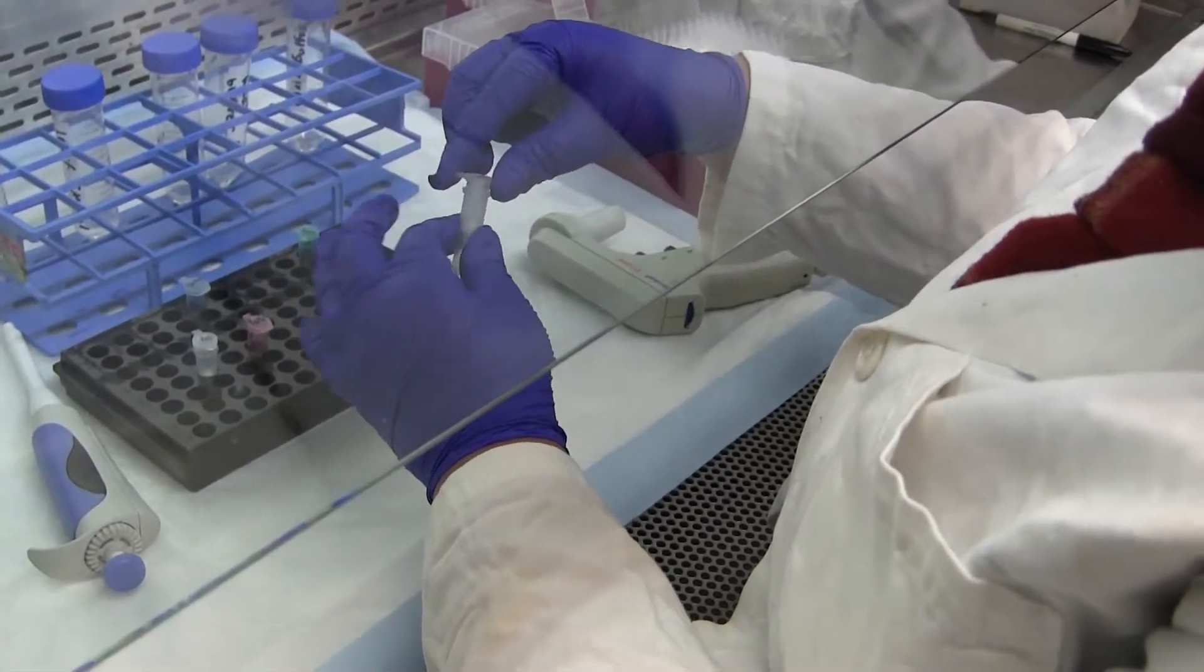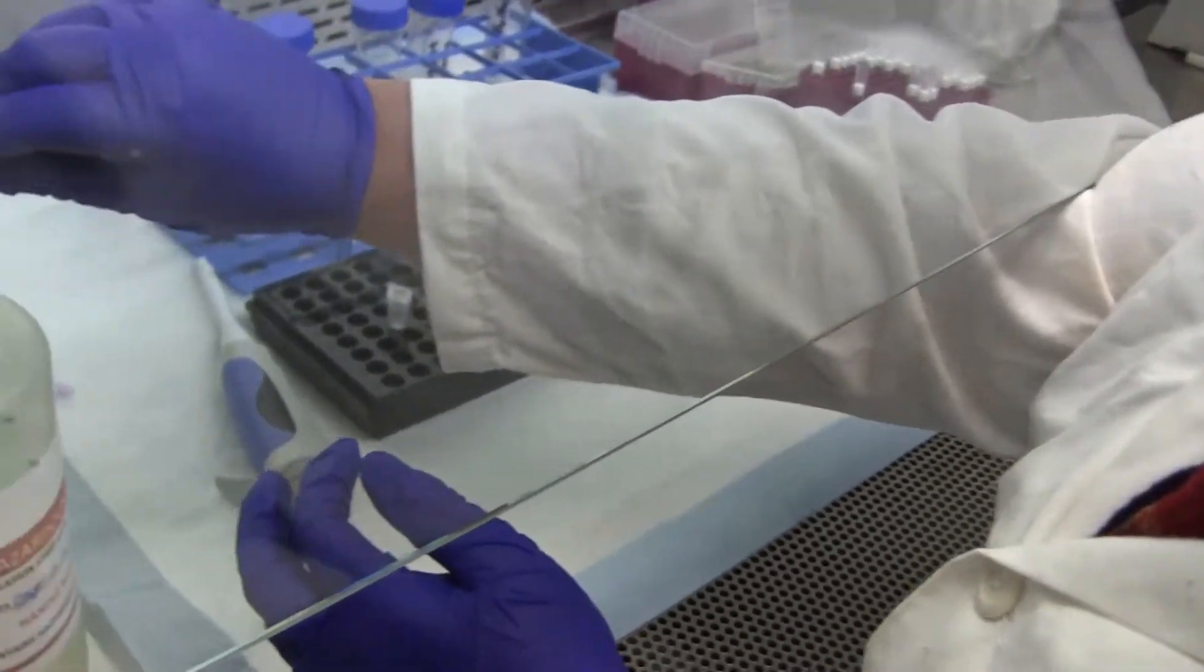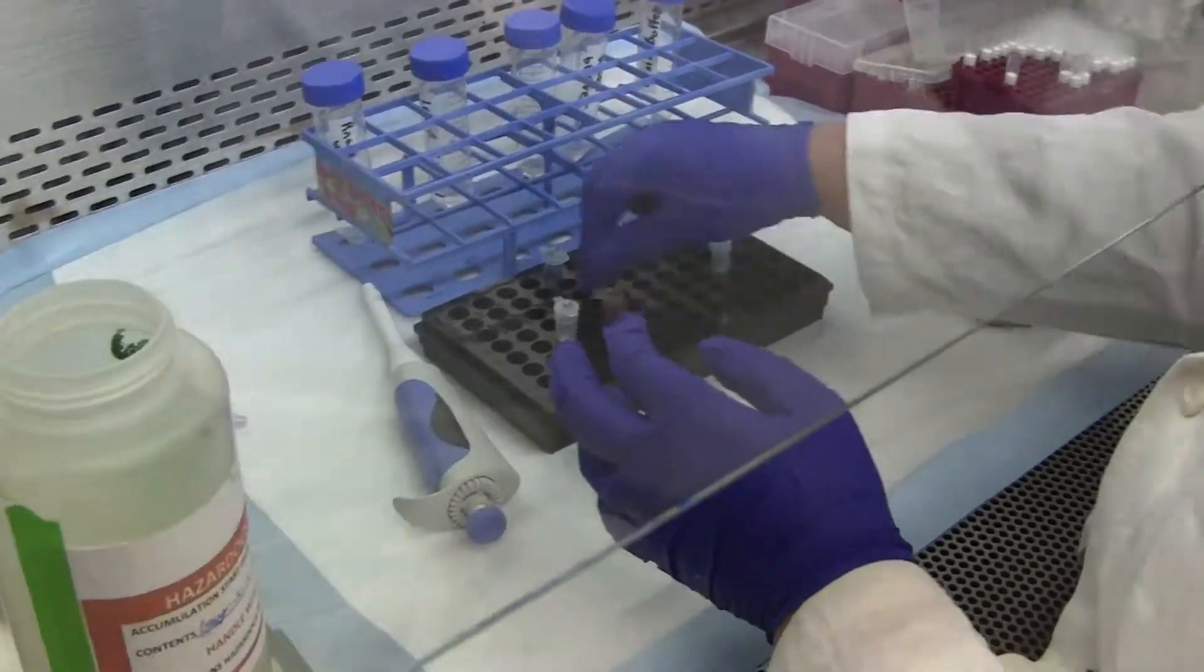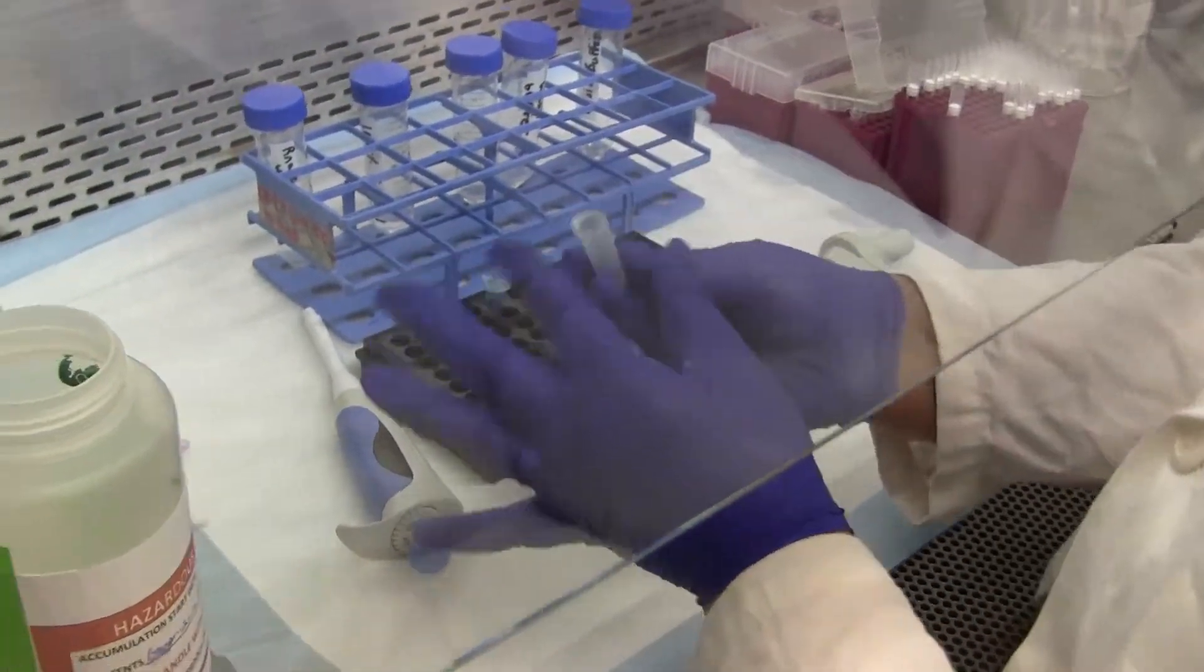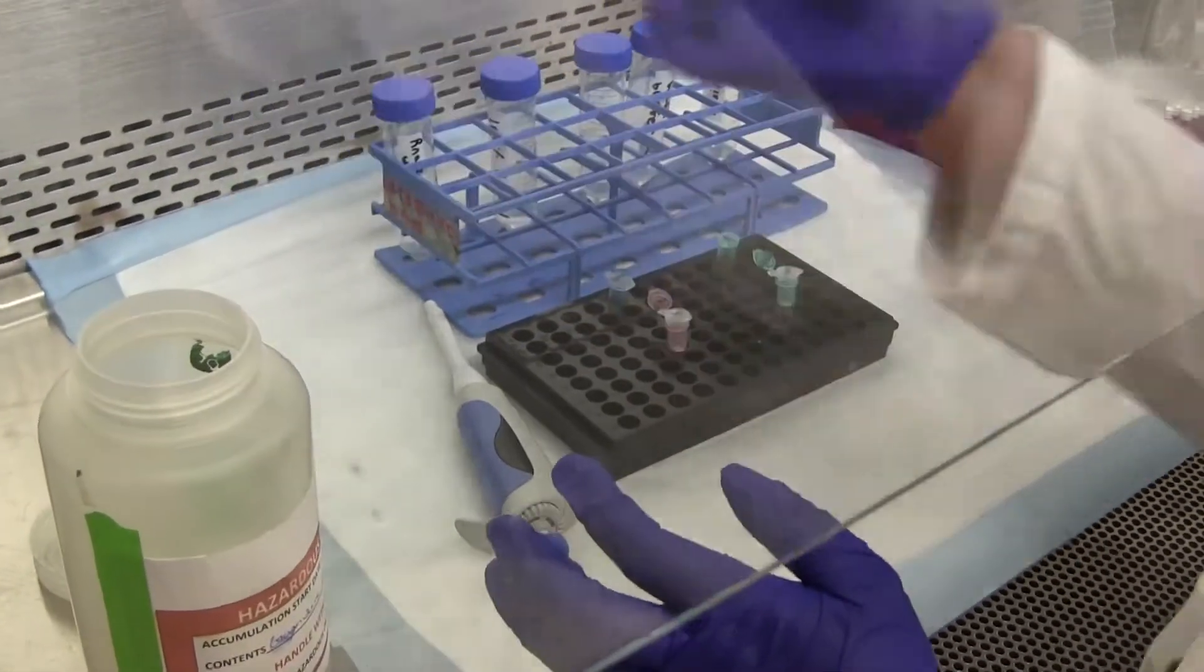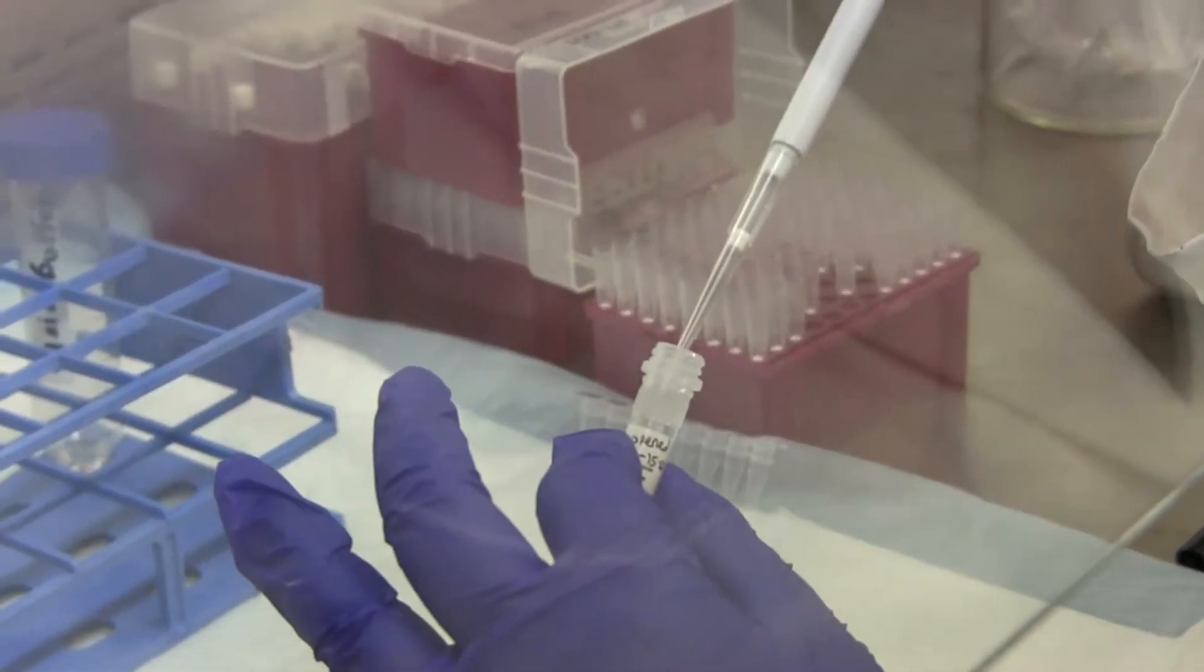And the final step, transfer the columns into fresh tubes. And now you see how the caps are open because the columns have their own caps. Now we're going to add, in this case it's just 25 microliters of the TE buffer. And for the Qiagen kit, we're using the AVE buffer that it comes with.